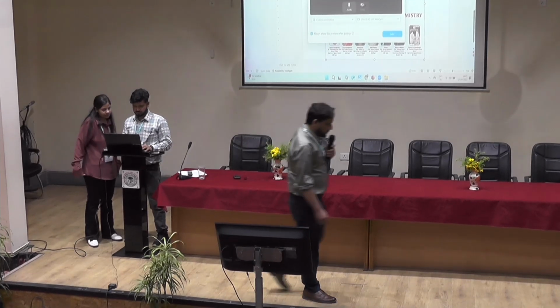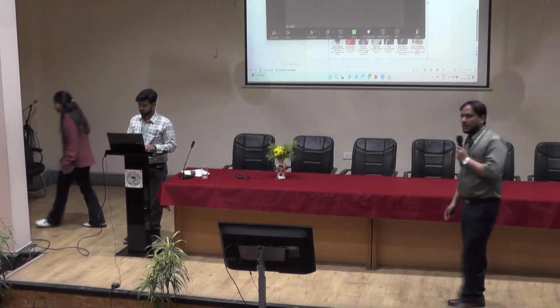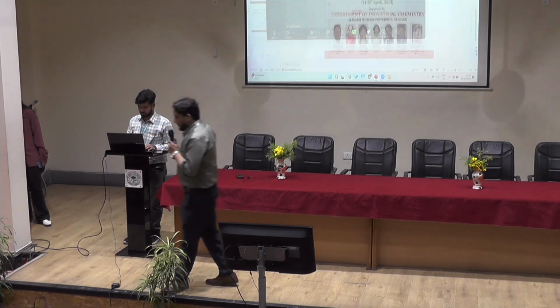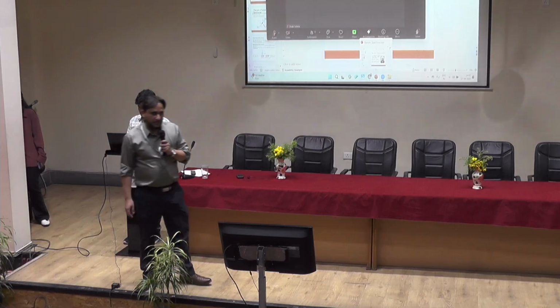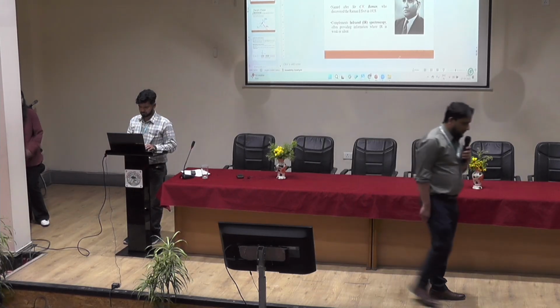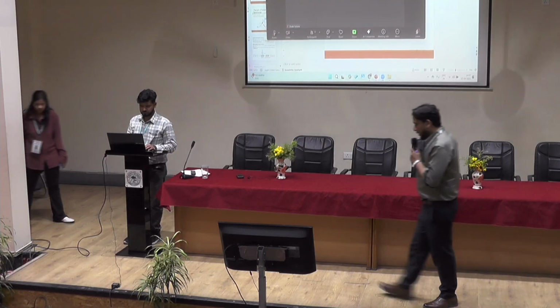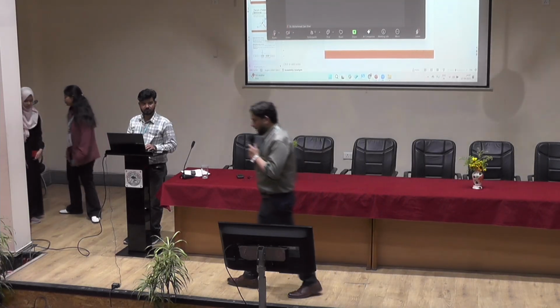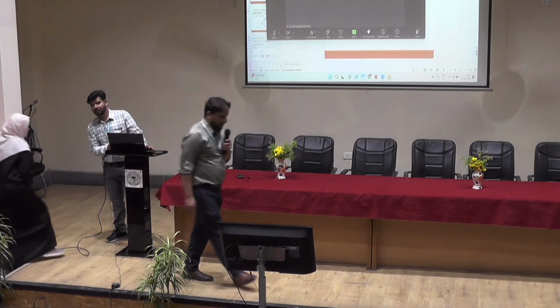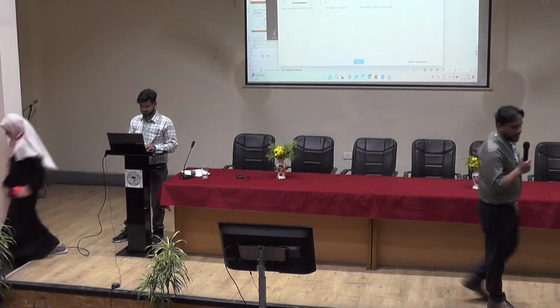Electron microscopy. We also have transmission electron microscopy over there. We have confocal microscopy, confocal laser scanning microscopy, NMR, and even XRD, single crystal. So in USIF, you will be given the demonstration of Raman spectroscopy, while in the interdisciplinary nanotechnology center, although there are a number of equipments over there, you will be given the demonstration of XRD.